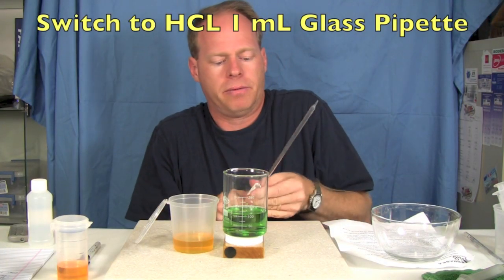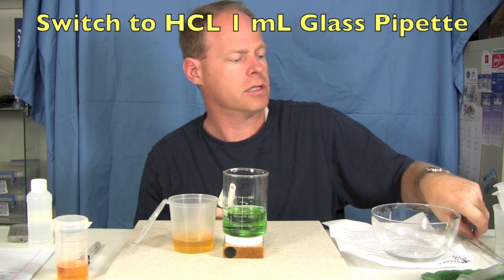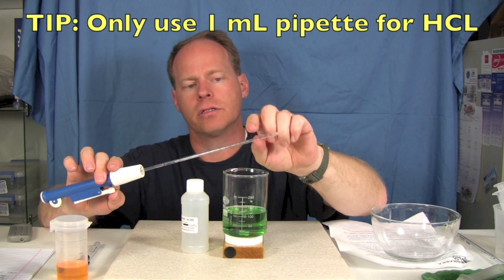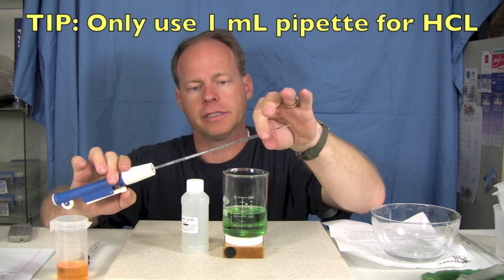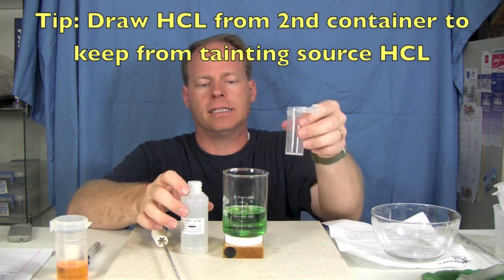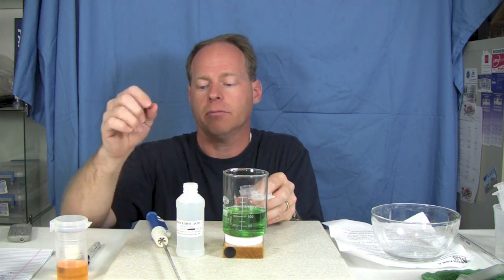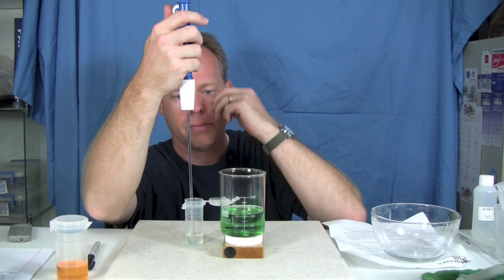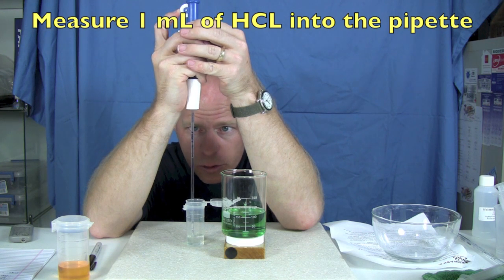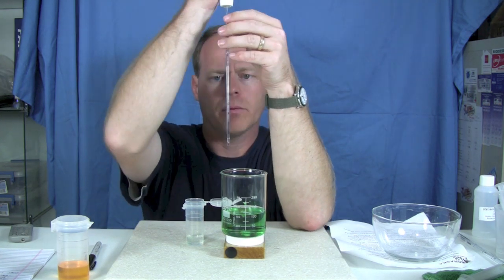At this point we switch to the very fine pipette, because now we're going to be measuring in precise amounts of hydrochloric acid. It's important to note that I only use this pipette for hydrochloric acid and when I'm done with it I always keep it covered. To be safe I'm going to pour a little bit of my hydrochloric acid into another container and draw from it, so I don't taint my stock. I'm going to suck up about roughly one milliliter of hydrochloric acid and we're going to start titrating.